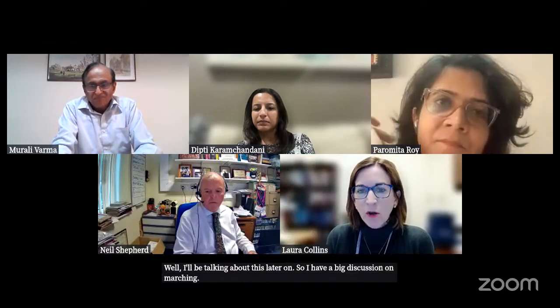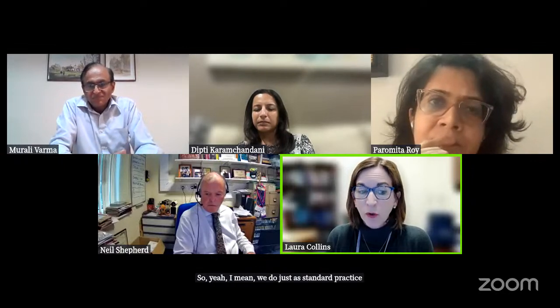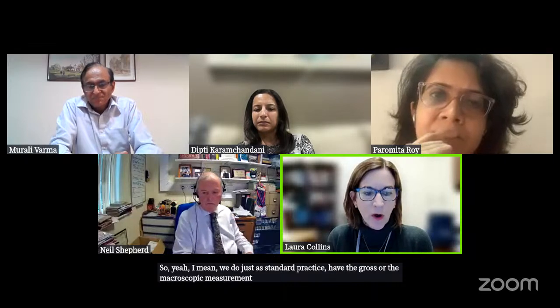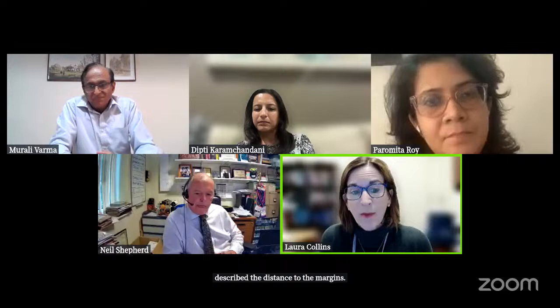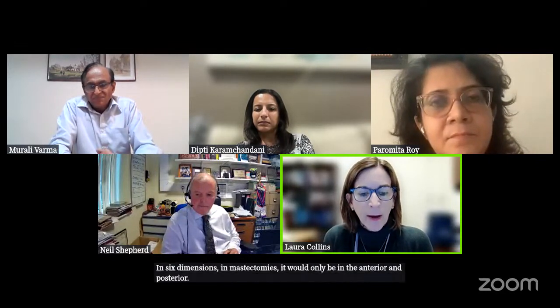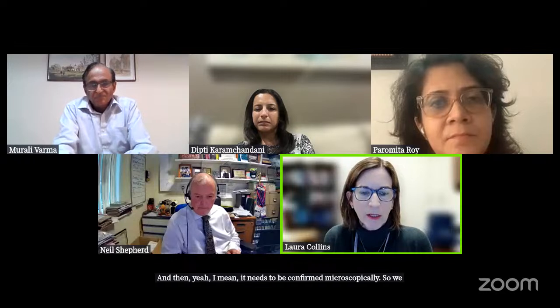Okay. So yeah, I mean, we do, just as standard practice, have the gross or the macroscopic measurement described, the distance to the margins in 6 dimensions. In mastectomies, it would only be in the anterior and posterior. And then, yeah, I mean, it needs to be confirmed microscopically. So we use the microscopic distance.